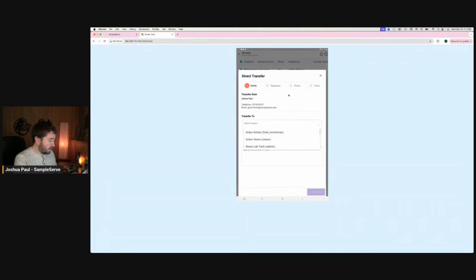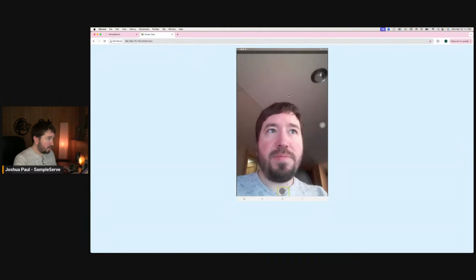Do direct transfer again. All right, I'll sign my name, the signature that goes on the chain of custody, and this picture will also go on the chain of custody as well.